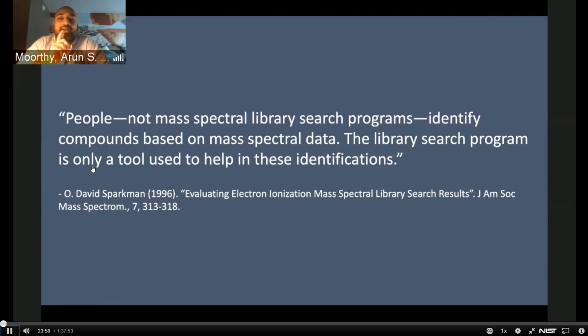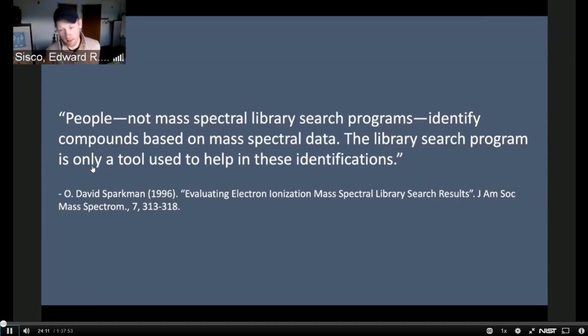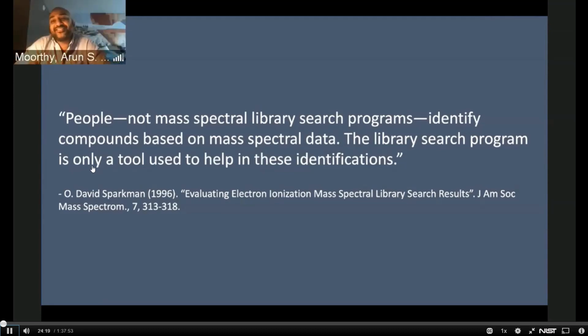And actually, you know what? I shouldn't answer this question. David Sparkman will be a good person to answer this question, and he will maybe be able to speak on this later. And the second question was, what instrument company data files does AMDIS read? Also, this is an answer I should know, but I don't know. But luckily, we have some experts that will be able to answer this in the next couple minutes. So I'll bring those back up when Ed and Gary speak. Perfect. Awesome.